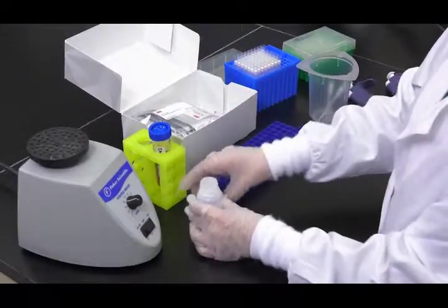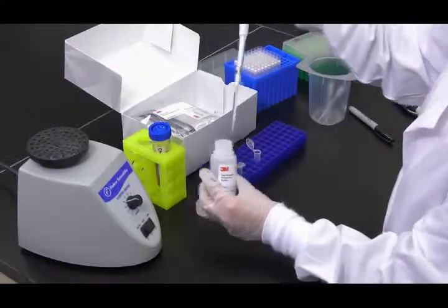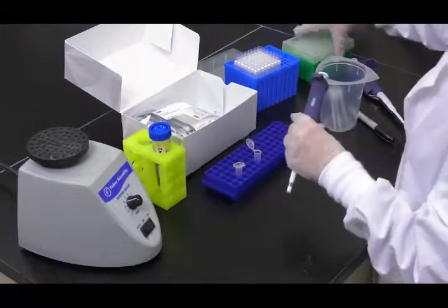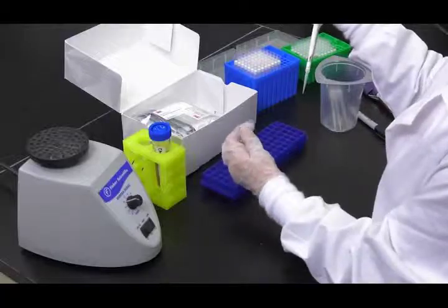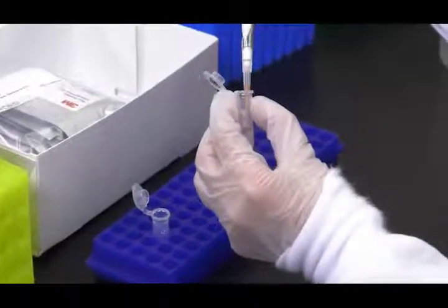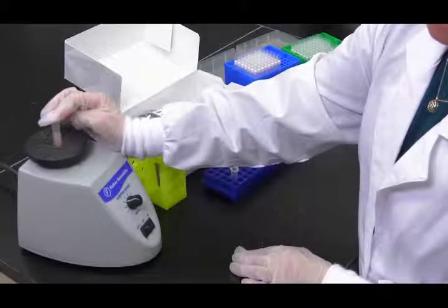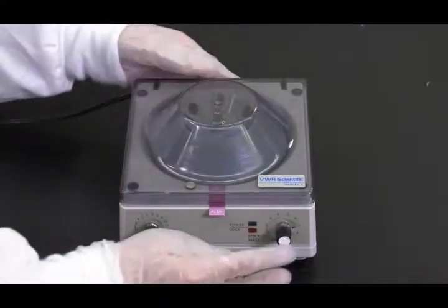Next, add 900 microliters of 3M extraction buffer into the second labeled microcentrifuge tube, and add 100 microliters of the prepared sample from earlier. Shake vigorously or vortex for approximately 15 seconds to mix thoroughly. Then centrifuge the tube for 20 to 30 seconds at 5,000 to 7,000 rotations per minute.